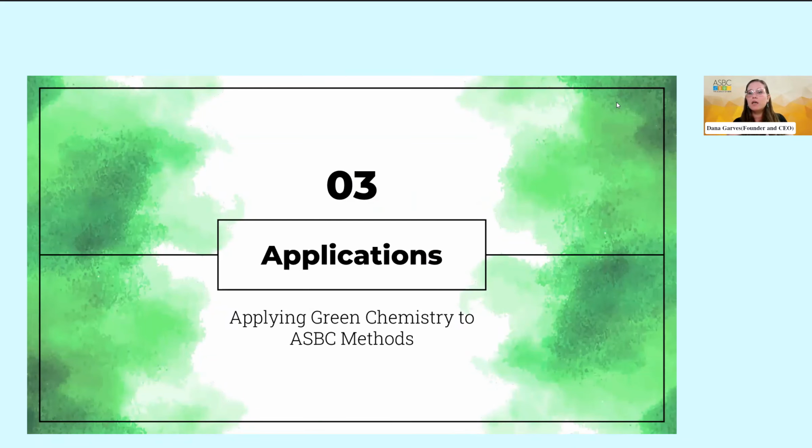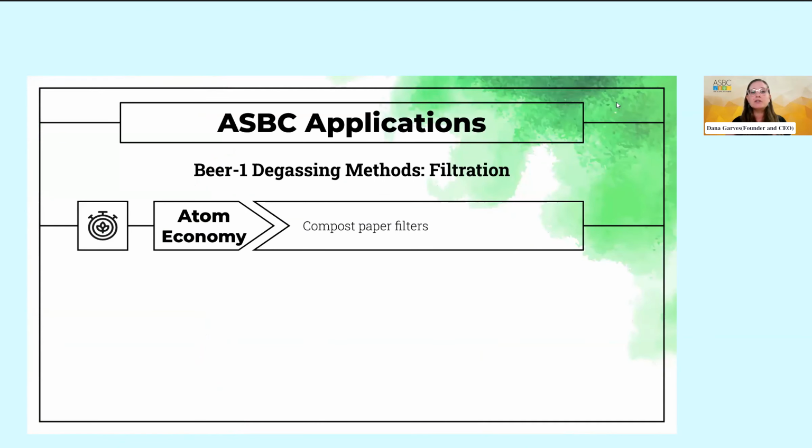So if you use those methods and you have ways that you've reduced your waste or that you've used green chemistry, please let me know so that I can disseminate that information to others as well. So let's dive into it. We're going to start really easy here and just talk about, when we're preparing our samples, how we can take small baby steps to using green chemistry.